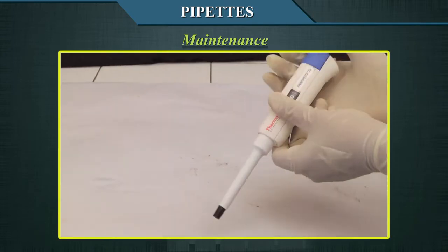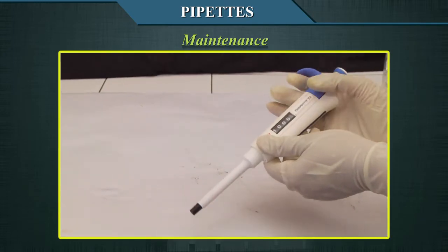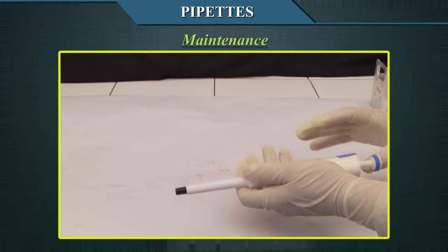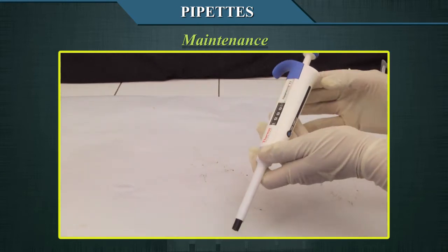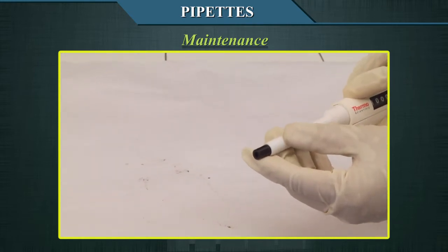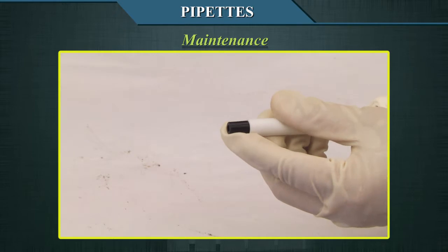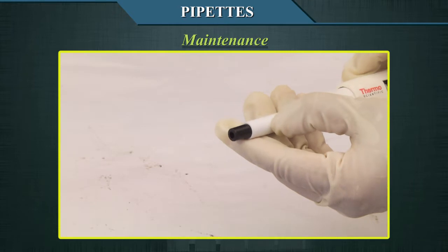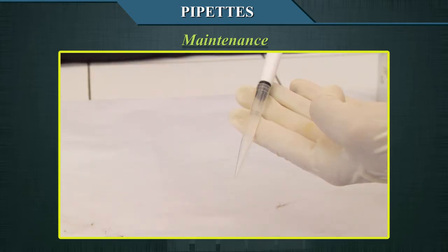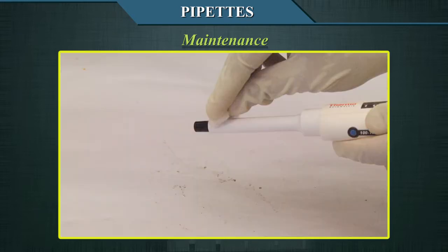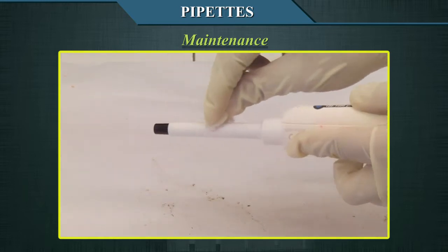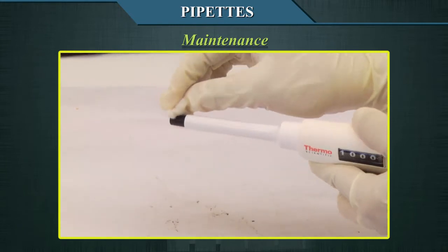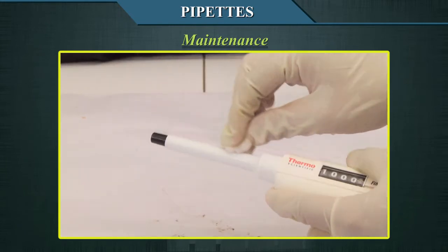Inspect the pipettes to verify the integrity and smooth movement of the mechanisms. Confirm that the tip holder is not displaying distortion or signs of being worn out, as it is essential for the accuracy of measurements. Put on a tip and fill it with distilled water — the pipette must not show any leak. Every day, verify that the pipette is clean. If dirt is detected, it must be cleaned using a suitable solvent or a mild detergent solution.